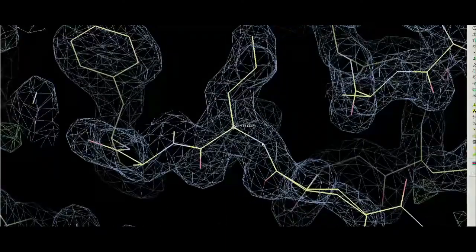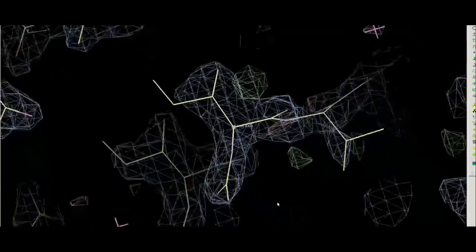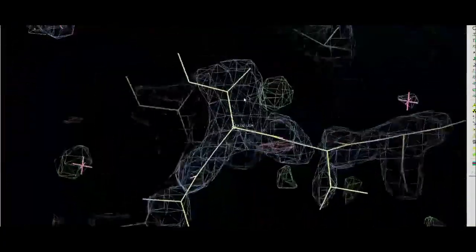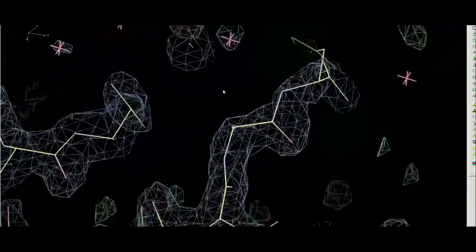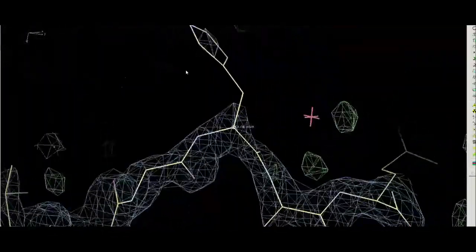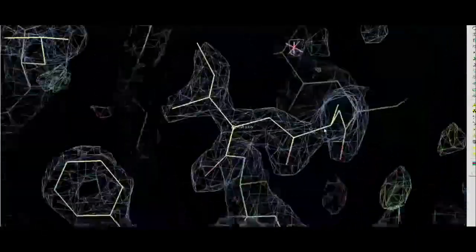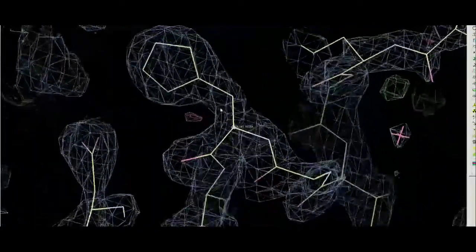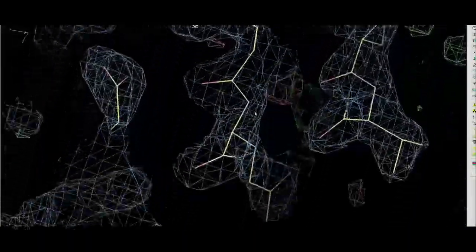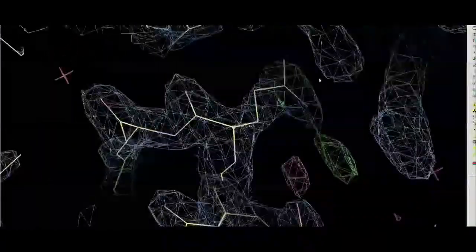In the N-terminal direction. Here we have our peptide bond in the C-terminal direction, and you can move one at a time, one amino acid at a time down the structure here. So here we have an isoleucine, then we can move down and we have a histidine, and a glycine, or no, this is a glutamine rather.